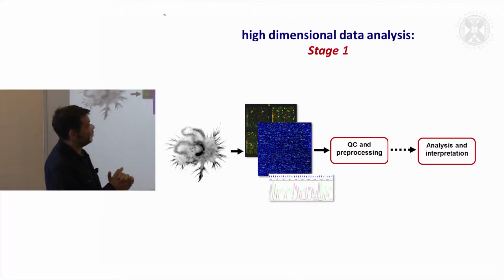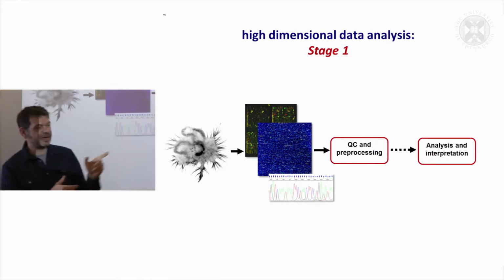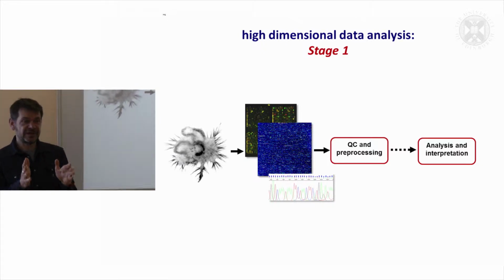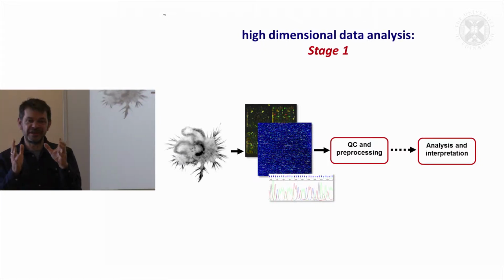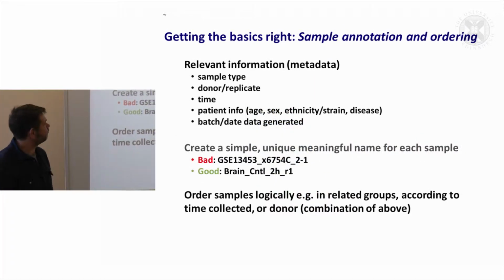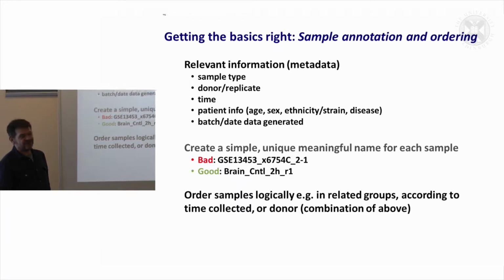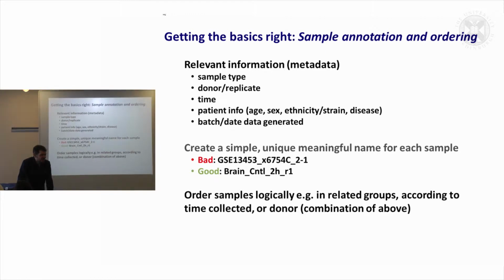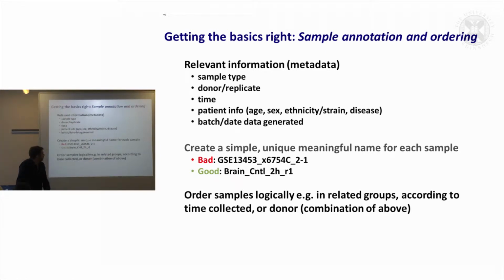Before you go anywhere, really, you should have some idea of QC and pre-processing. And I'll explain what I mean. It helps if you know something about your data before you put it into a layout. This is really basic stuff, but it's amazing how many people don't do it, and don't do it properly.